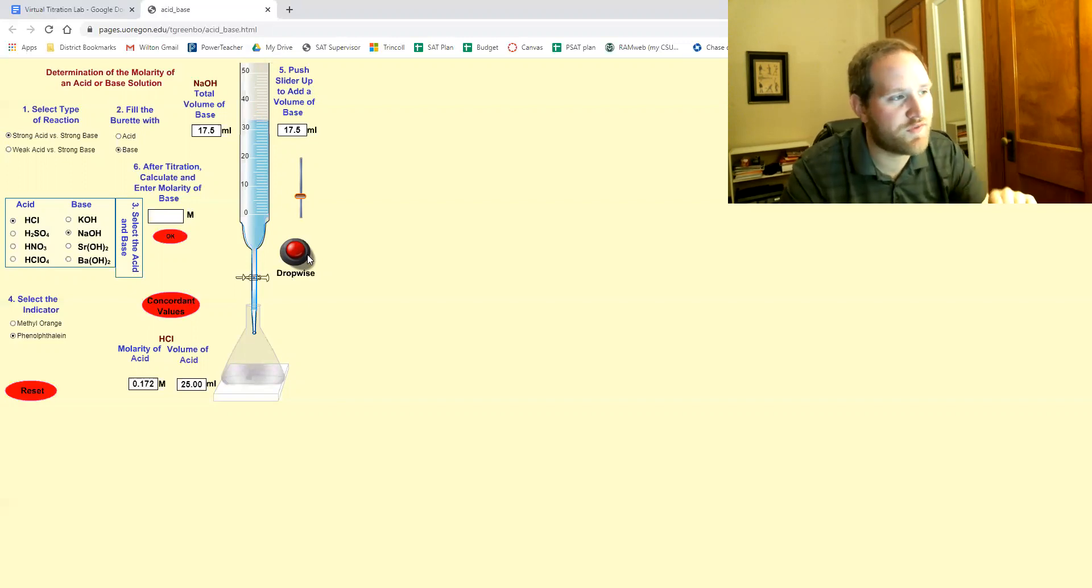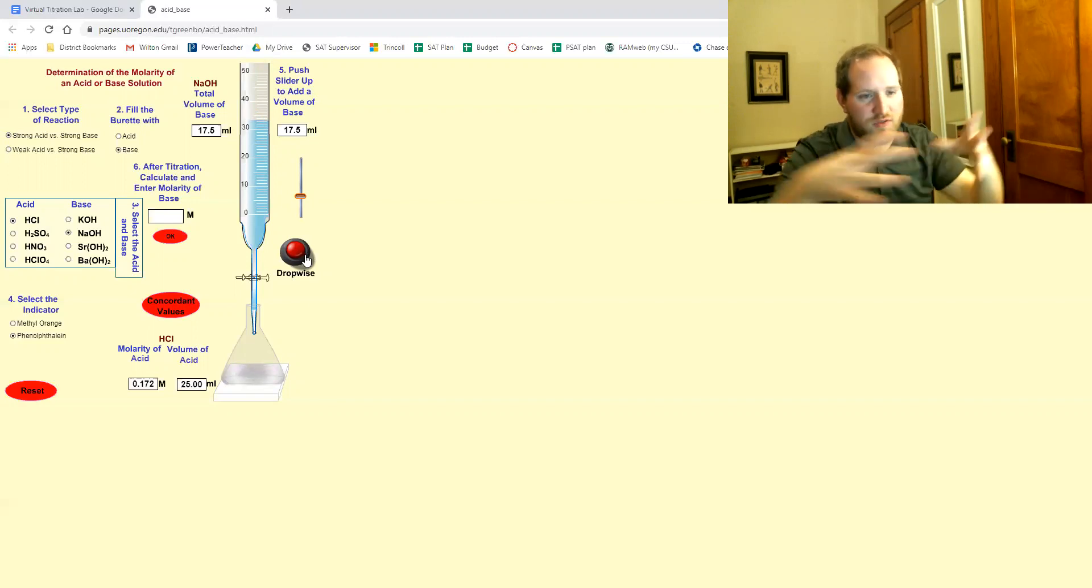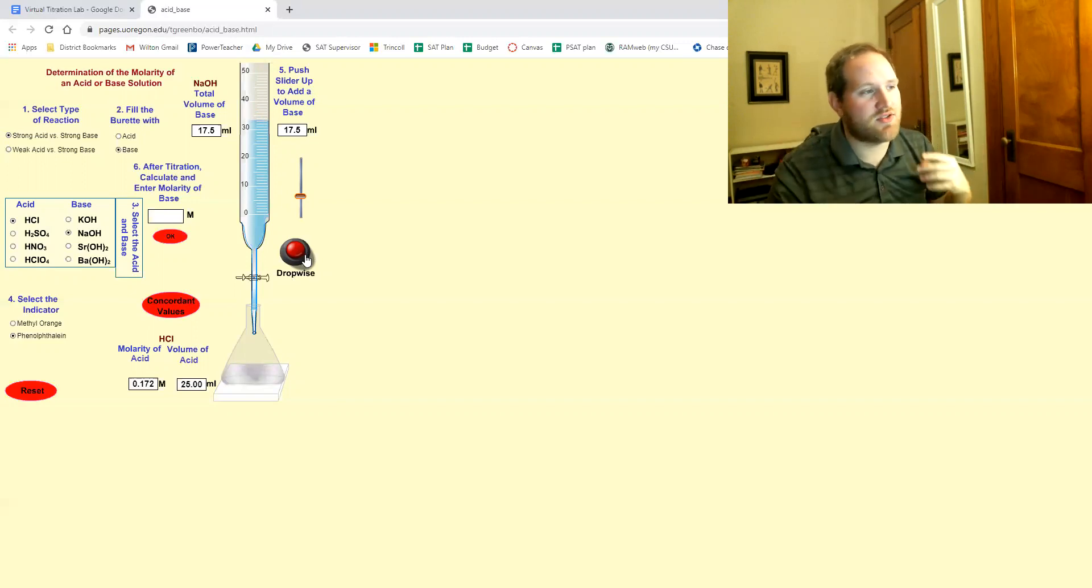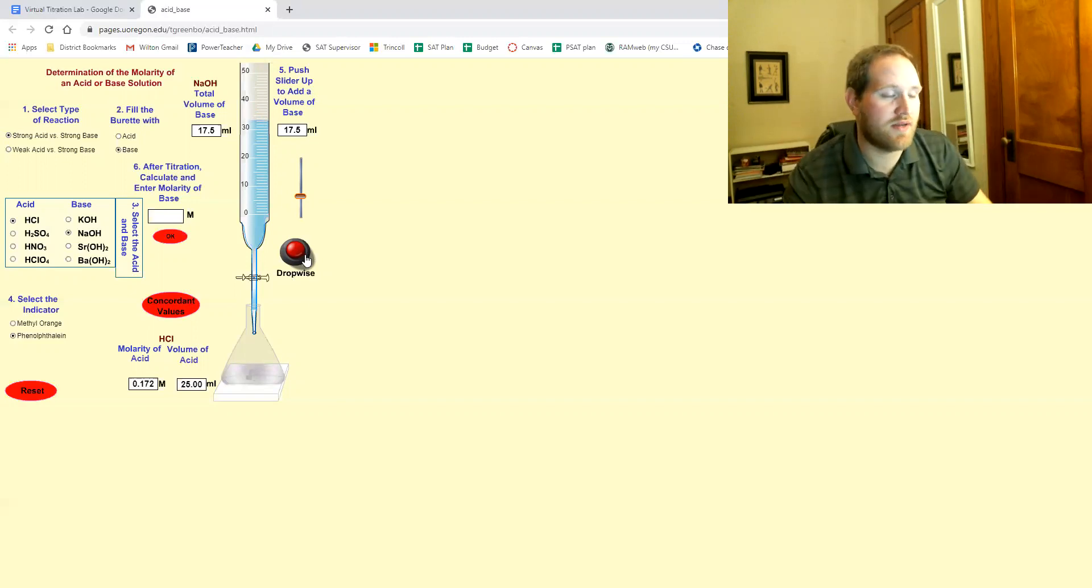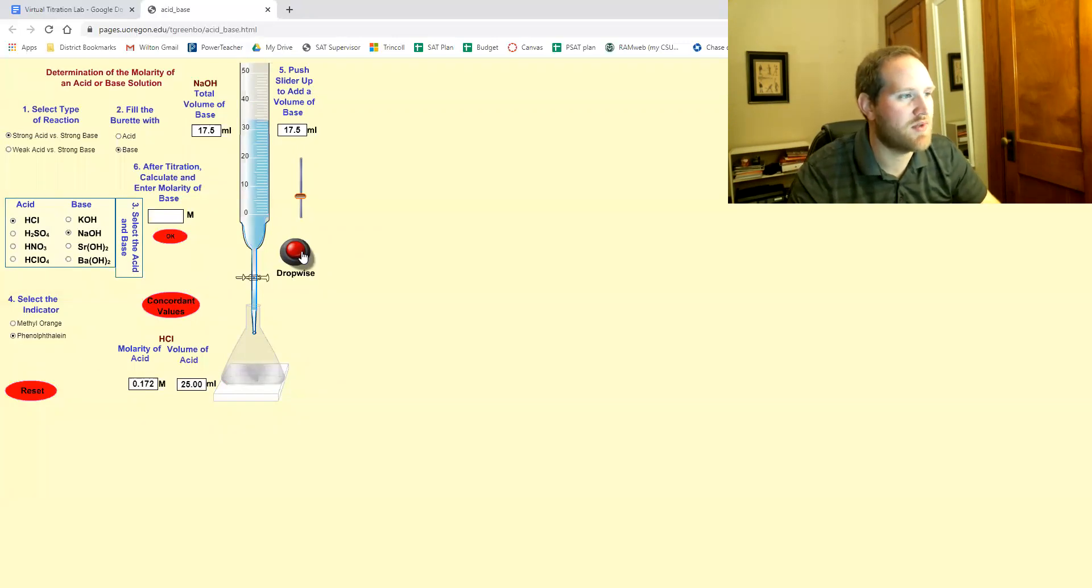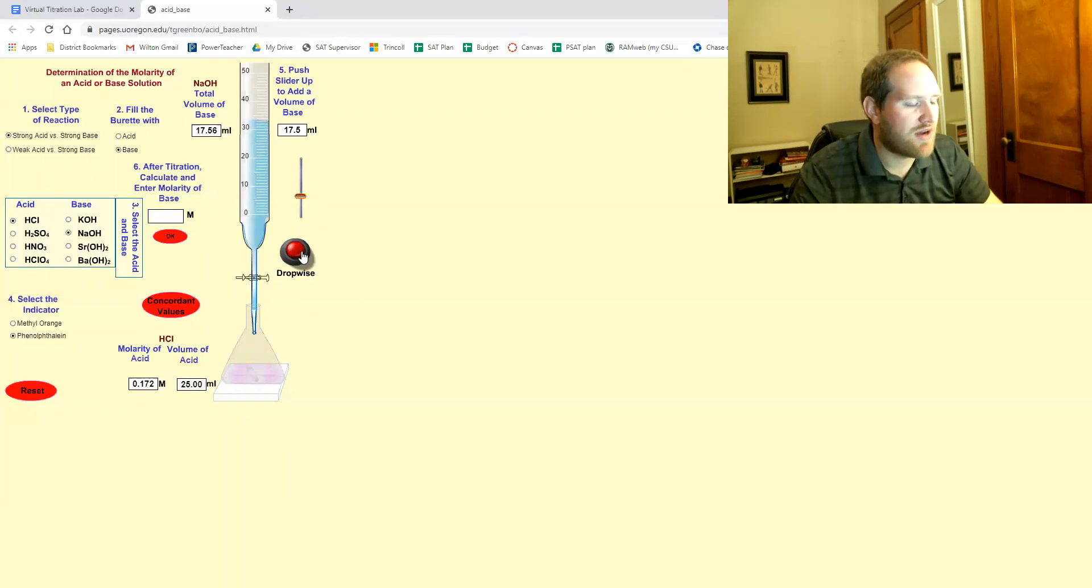So as soon as you first see that little flash pink, that means you're starting to approach your end point. And now we switched to drop wise. So I'm going to click this button and add one drop at a time.